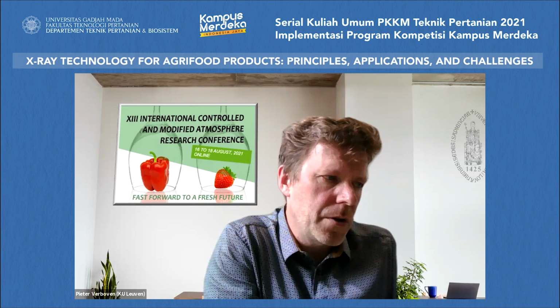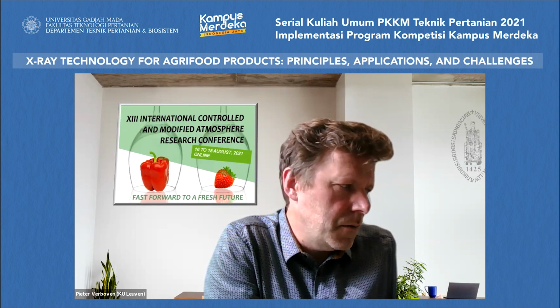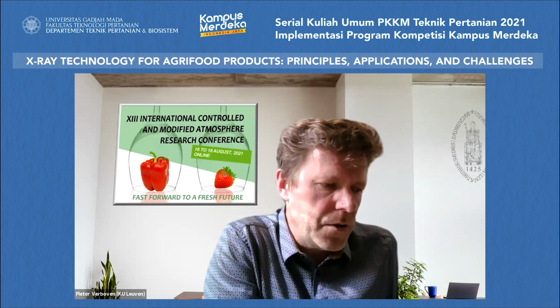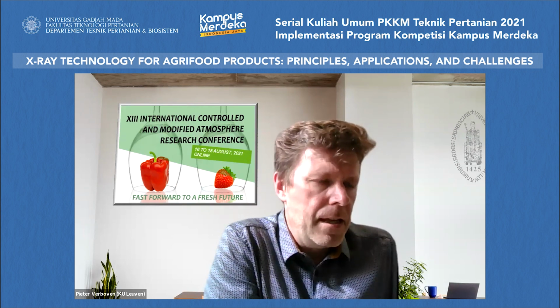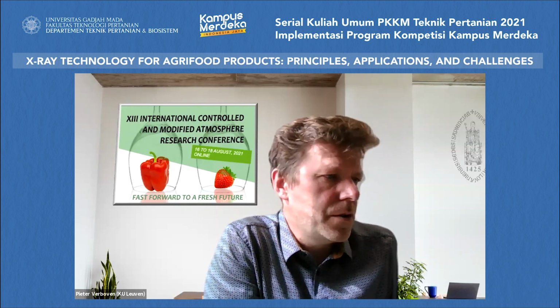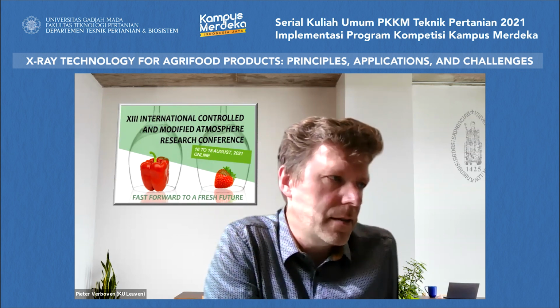Everything related to soil, soil science, in relation to porosity of soils, which will determine their water absorption characteristics, X-ray is being used a lot. Of course, you cannot use it in the field. You need to take samples of the soils to do the analysis.